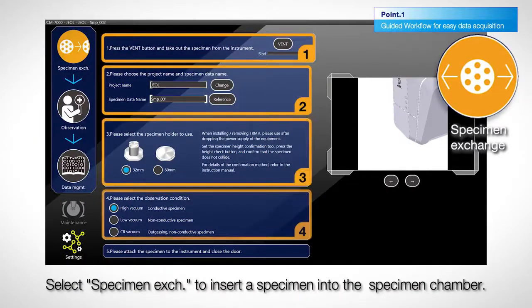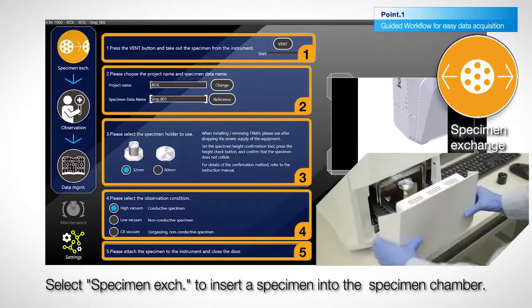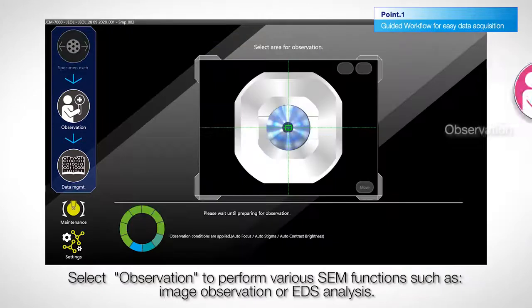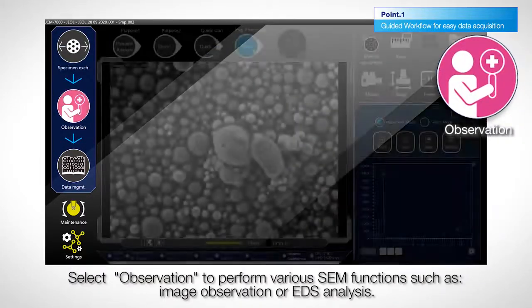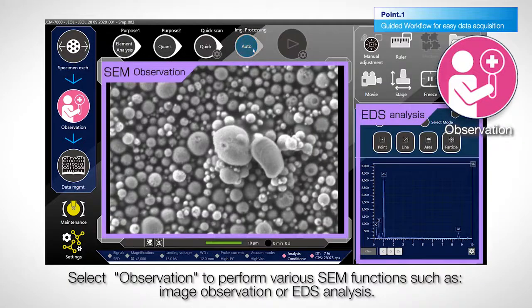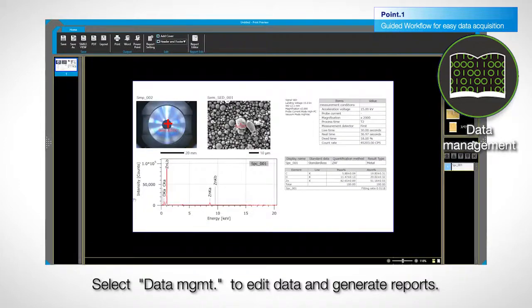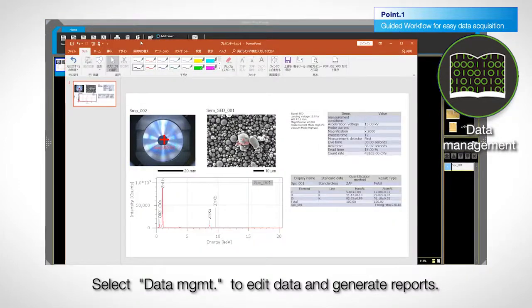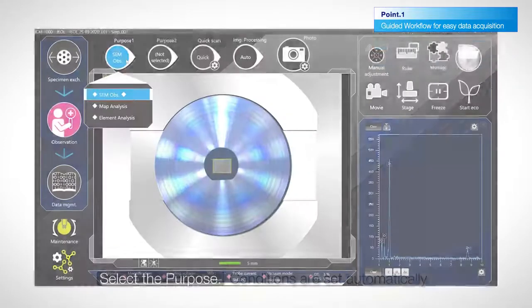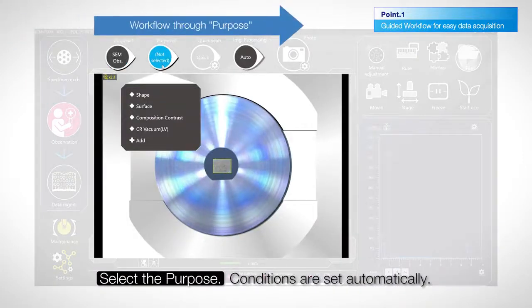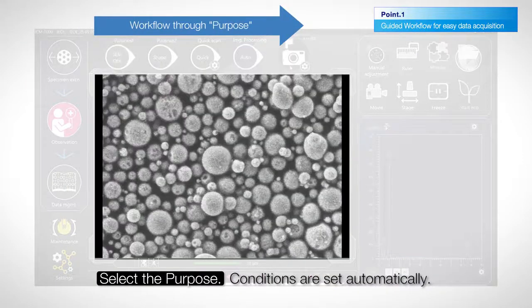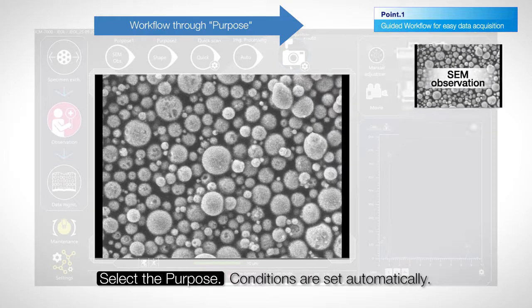Select the specimen exchange icon to insert a specimen. Select the observation icon for imaging and EDS analysis. Select the data management icon to create reports. By selecting the purpose or desired application, SEM conditions are set automatically for easy data acquisition.